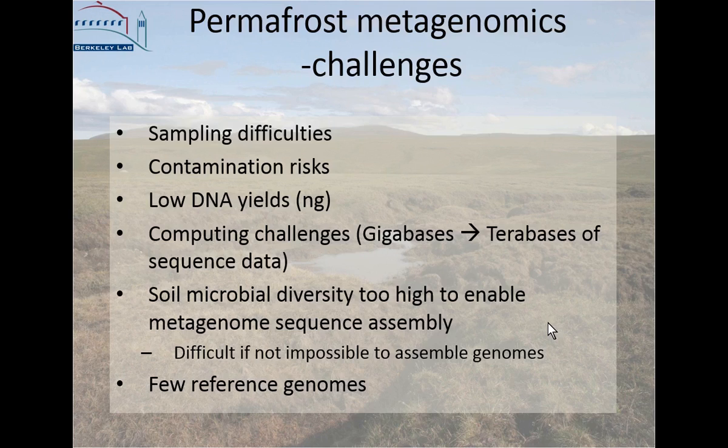And then this is a bit older story, so I was having a lot of computational challenges at first because I was not working only with gigabases but closer to terabases of data. So there was a lot of terabytes of data. And then because it's soil, it's really diverse. And I was doing a lot of work with the metagenomic assembly to get nice assemblies from these soils. And then there were also only a few reference genomes from soils available.